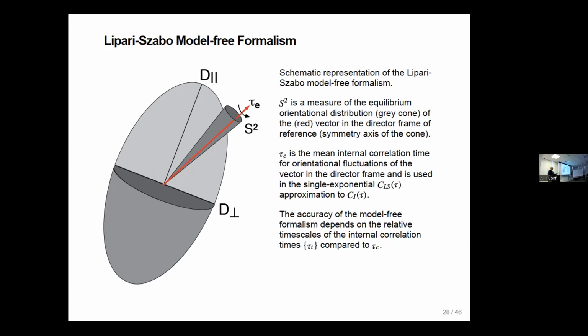And if you want more information, we have to explore different parts of the spectral density function, because even by 500 megahertz, we're already in the 1/omega squared decay part of these spectral density functions. So to get more information, we have to get to that point where they roll over. And that's proving very hard to do.